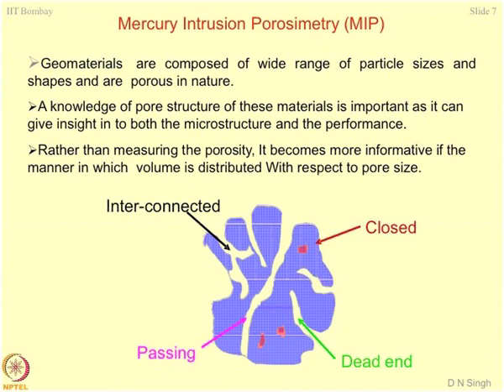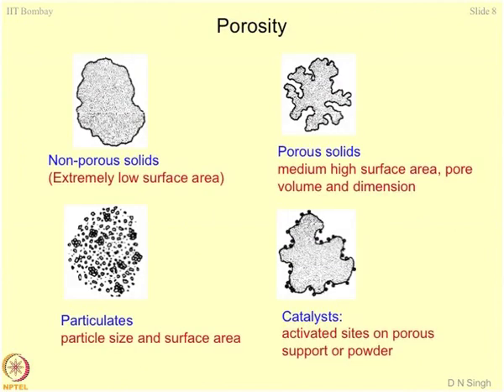So, this is where most of the time people have given thought to how total porosity of the system can be measured, and that is where mercury intrusion porosimetry becomes quite important. In Western countries, they don't use it because it deals with mercury and they are too scared of mercury as a poisonous and toxic material. But anyway, we continue our study using these things.